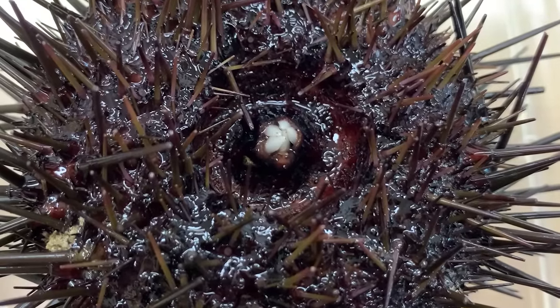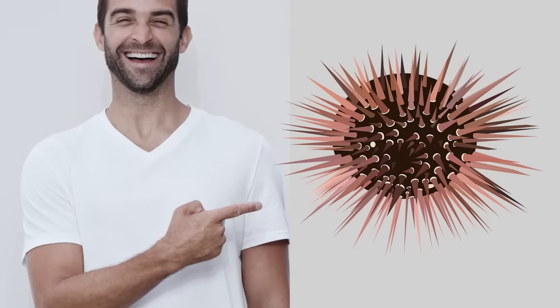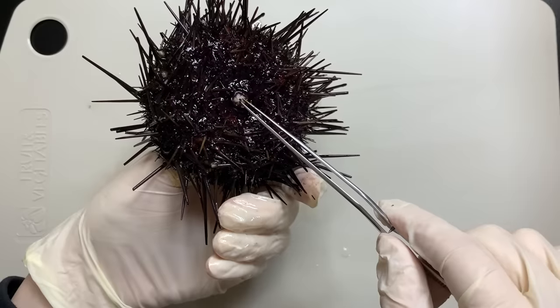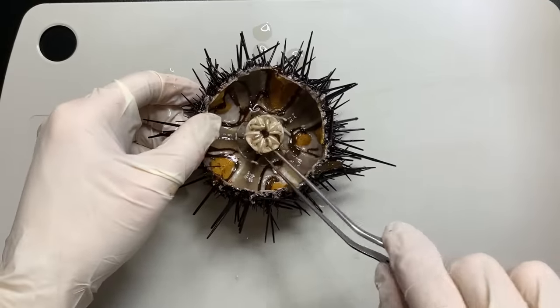Sea urchins also have 5 teeth. Sea urchins really do have 5-fold radially symmetric body structures. The digestive system of sea urchins extends from the mouth to the anus, and if you look inside the part where the mouth is located, you can find a very strange structure.